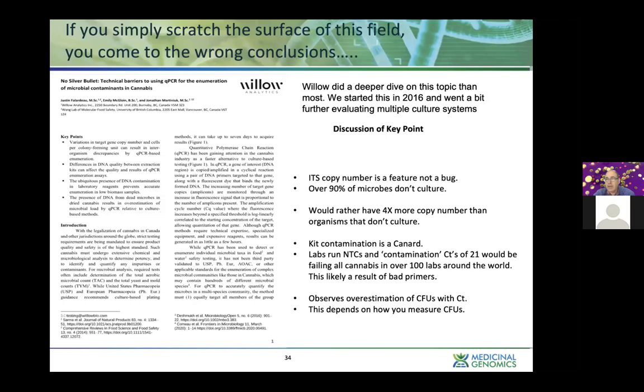However, they got about halfway through this compared to what we did in 2016. They noticed there was discordancies between CFUs and CTs, and that can be true. However, if you go one step further, you'll notice this is not as much a reflection of the discordance in PCR as it is in the fact that none of the plating systems ever agree.